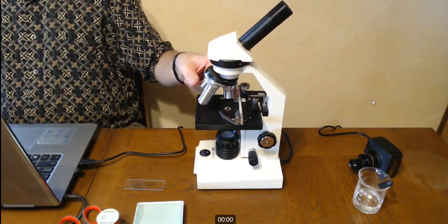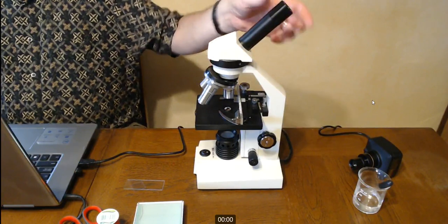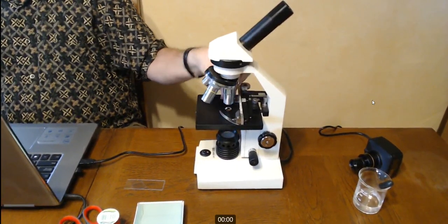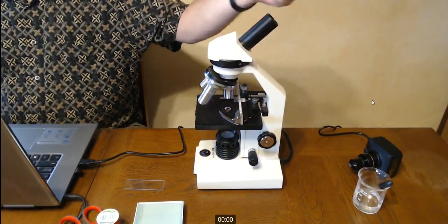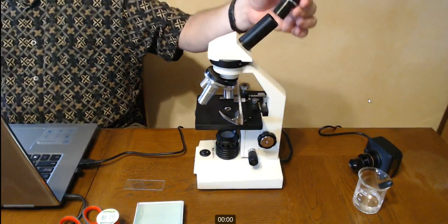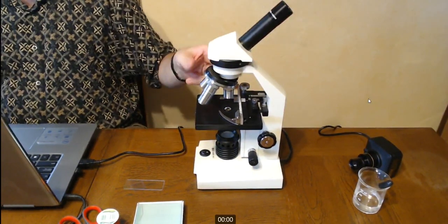There are 3 objectives here. The shortest one, the low power, yellow, the medium, and then finally the green, the high power. If we look at that, let's look at our eyepiece. Our eyepiece has written on it on the side 10 times. So when you look at things through this eyepiece, it makes it 10 times larger than it was before.